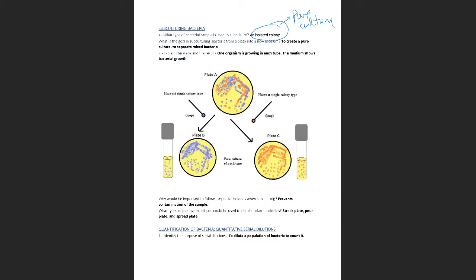Okay, so the steps on making a pure culture is essentially get a single colony and transfer that colony onto a plate, streak for isolation. And now you can see there's only one type of colony. Again, take one colony, put it in a broth, and now you have a pure culture. You could also go from here directly into the broth, but that extra step is kind of like an extra assurance. So that will be a way to create pure cultures from mixed cultures.